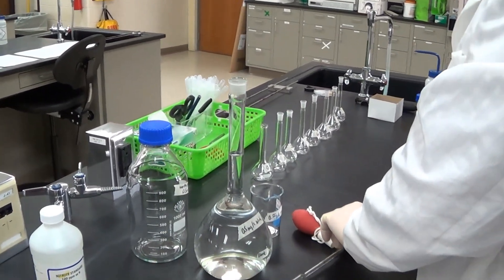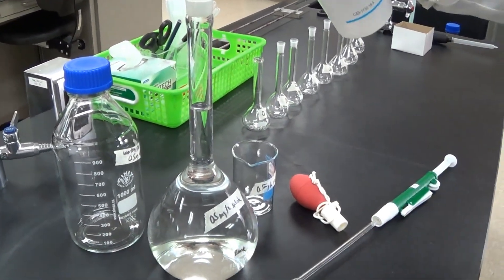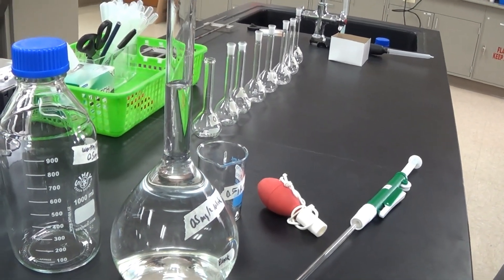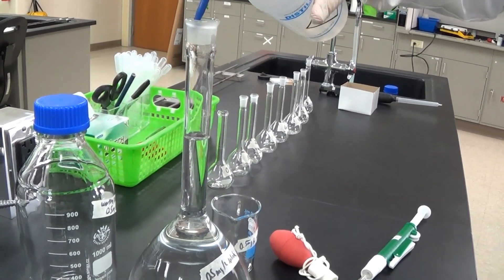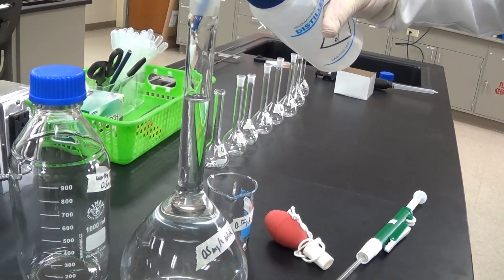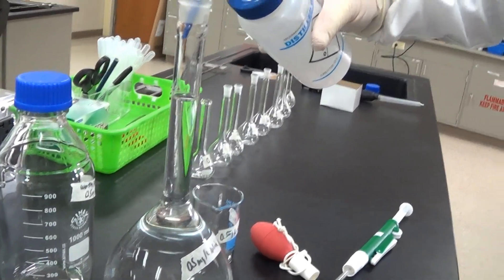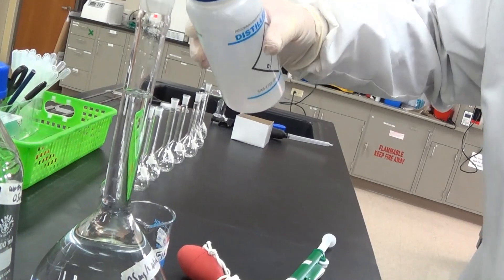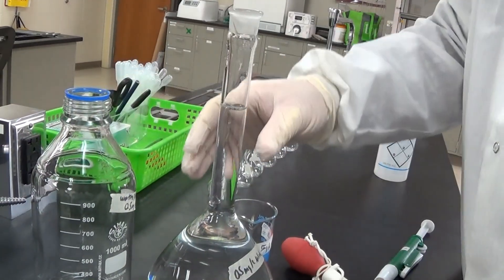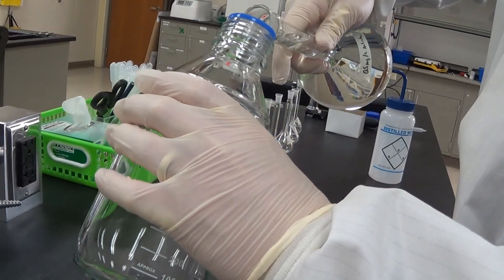Pipetting the standard. Reading at eye level — looks pretty good — so we're just going to put it in the large bottle so we can mix it well.